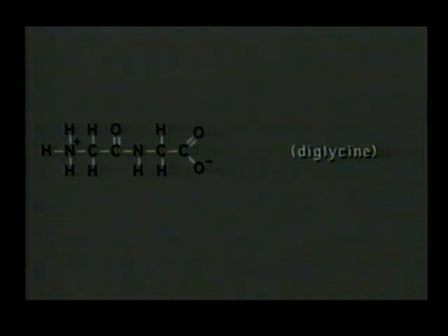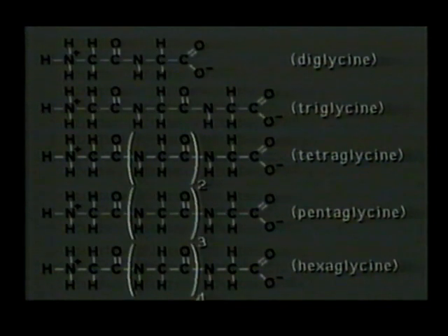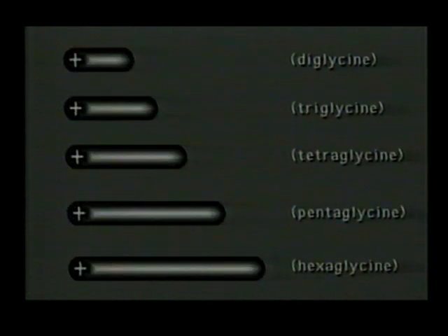Looking at the actual separation of a peptide series, we can see this taking place. The simplest case to consider is that of a series of glycine peptides. If we take 5 peptides, di, tri, tetra, penta, and hexaglycine, and make them up in a buffer solution of around pH 2, the peptides will all be fully protonated, and each will carry a charge of +1.